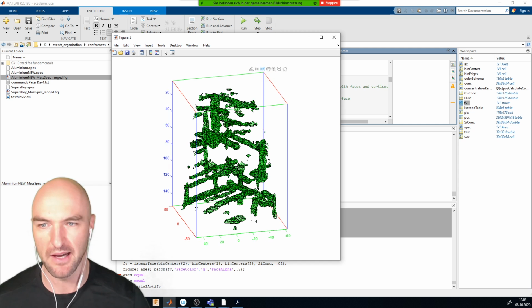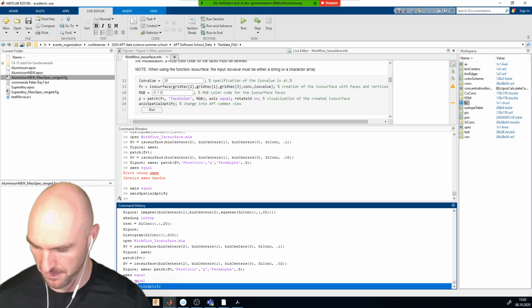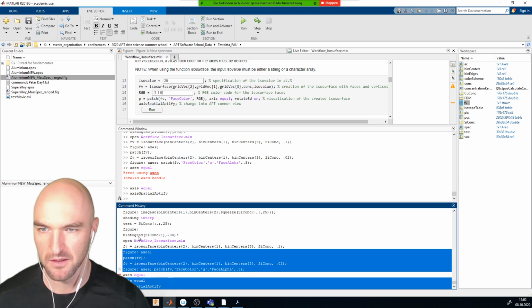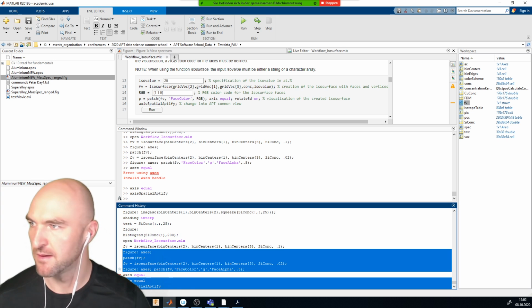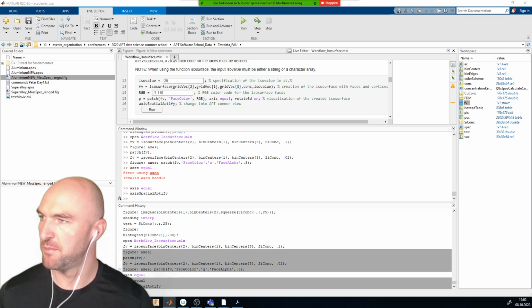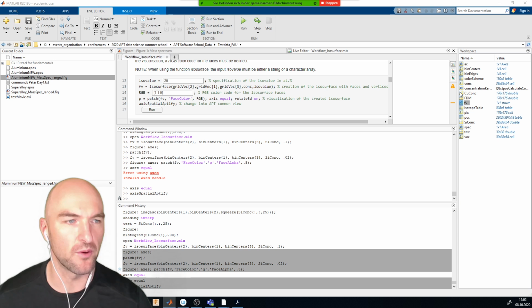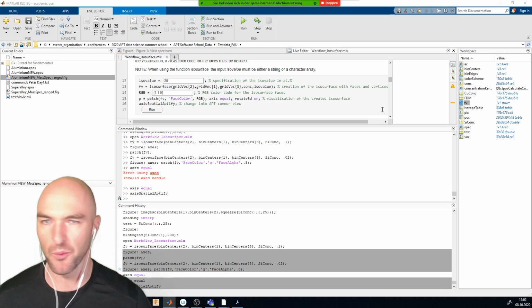And as always, I will post the rest of the code. I think that one I had already. And will I save the workspace? Yes, I can save the workspace. I will save the workspace so that we can send it out for tomorrow.